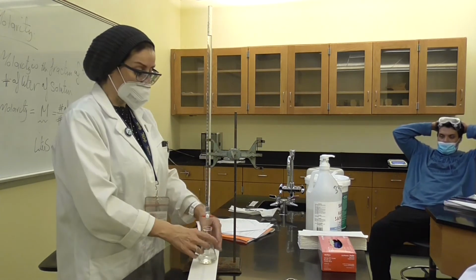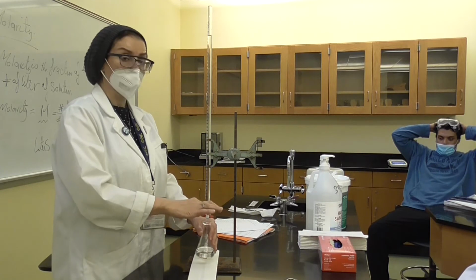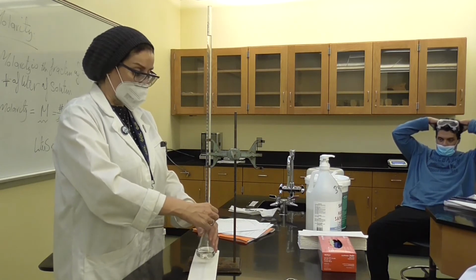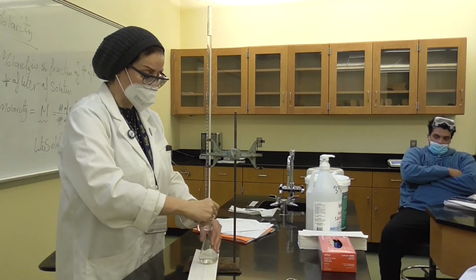Usually we have one hand holding the flask, the Erlenmeyer flask, and the other hand is holding the knob. And we're going to open it. In a titration, every 1 ml you swirl.